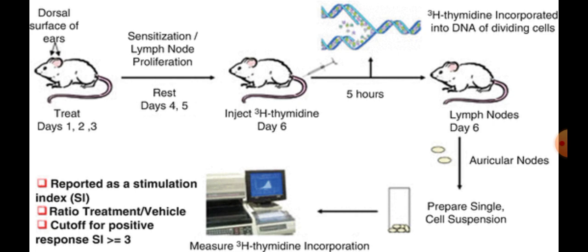Overall, dose and vehicle selection means a minimum of 4 animals per dose group and a minimum of 3 concentrations of test substance, plus positive and negative control. For example, negative control is treated with vehicle only and positive control as appropriate. The duration of the treatment is 6 days, and thereafter the animals are killed.